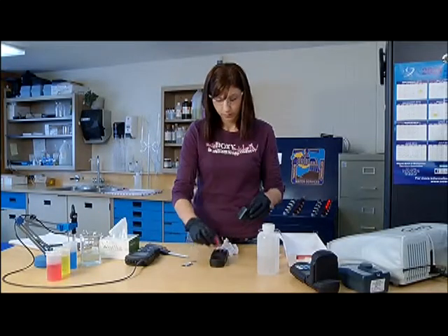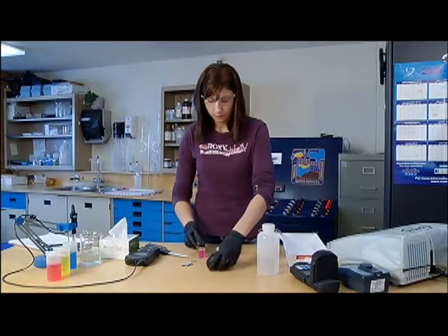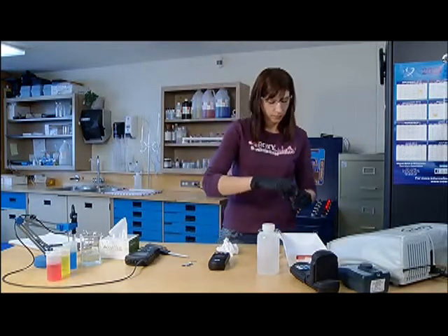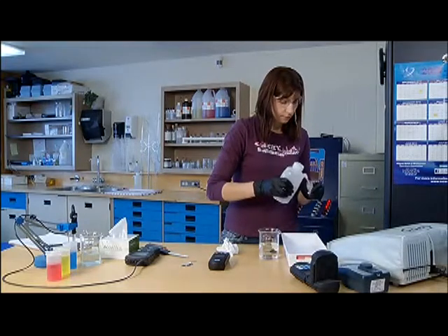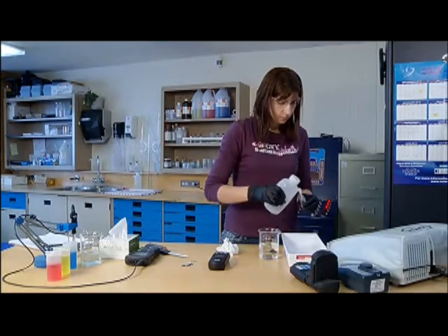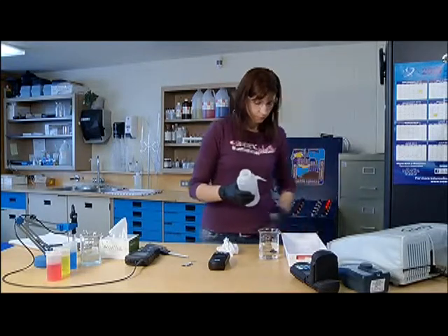Prepare the instrument for storage. Clean the sample vial with pure water so it is clean of contamination for its next use. Finally, clean the work area.